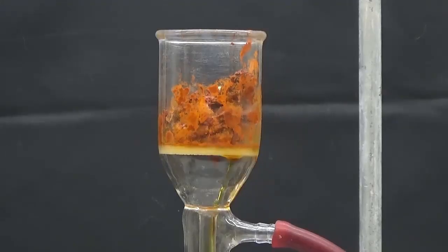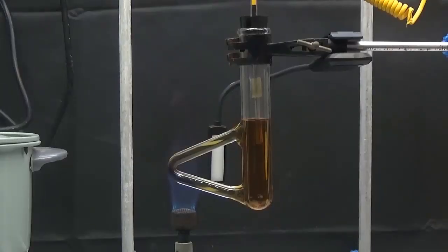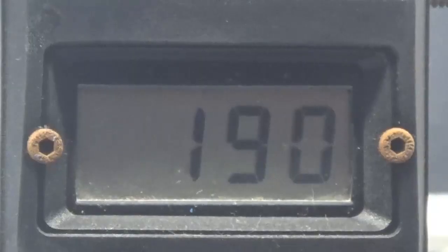We activate the vacuum to remove the acetic acid and collect the purified isatin. We dry it in an oven at 80 C. Purified isatin has a defined melting point of 191 degrees Celsius.